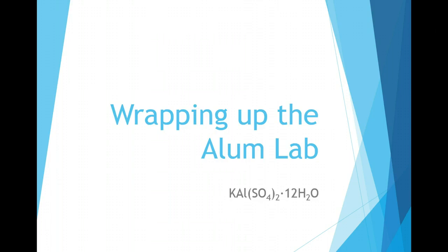This presentation will review the Alum Lab and discuss the steps and calculations necessary to finish the lab. Alum is known as potassium aluminum sulfate, and if you take a look at its formula, you will also notice that it is a hydrate, meaning that there are 12 waters of hydration. And so when alum crystals form out of solution, as the crystals form, 12 water molecules are trapped as part of that structure.